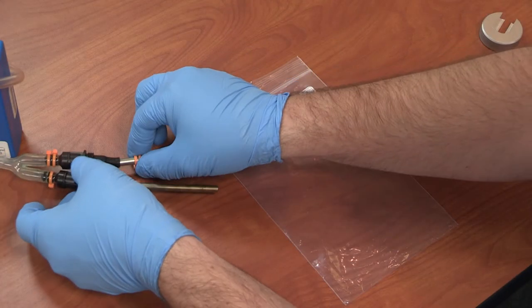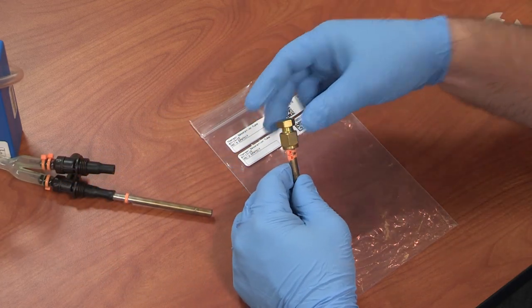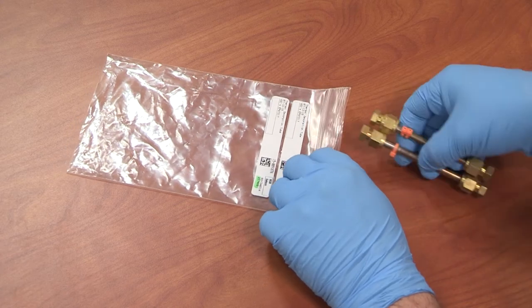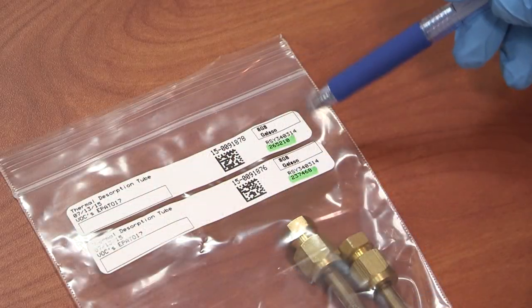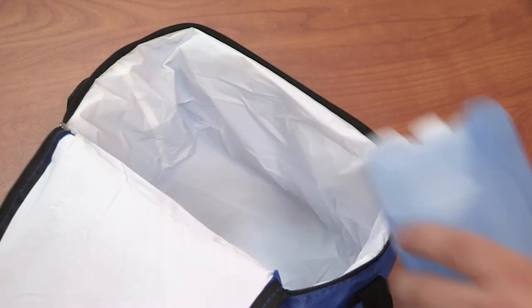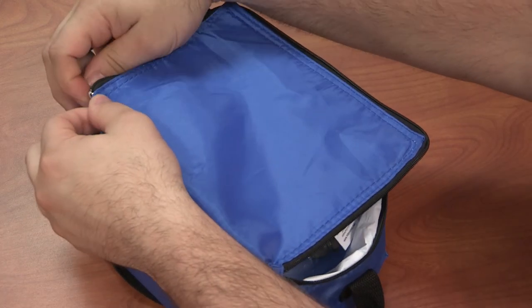While wearing the provided gloves, remove the tubes from the pump tubing and reattach the Swagelok end caps using the provided wrench set. Be sure to keep the sampling pairs together when you place them back in the original packaging. The sample bags will arrive pre-labeled — be sure to place each tube in the bag that matches its serial number.